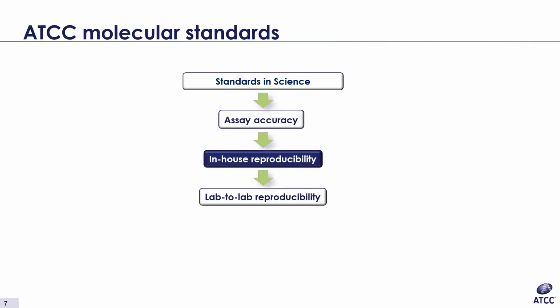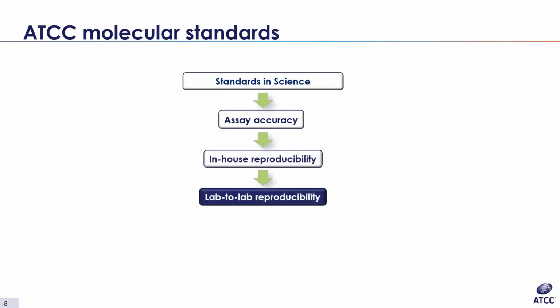After the assay is functional, there's lots of optimization testing to make sure that it works consistently and to try to drill the limit of detection as low as possible. And then last, the assay graduates out of the lab as it's published or goes to a beta tester in advance of a product launch. At this point, a lot of work has gone into making sure that it works reliably in-house, but the transition to another lab is a big step.